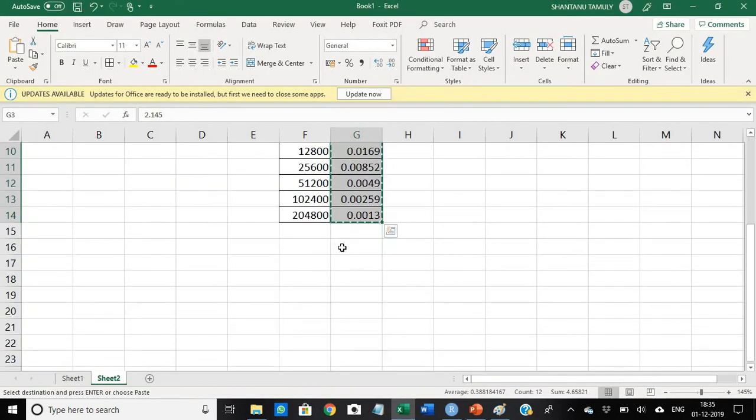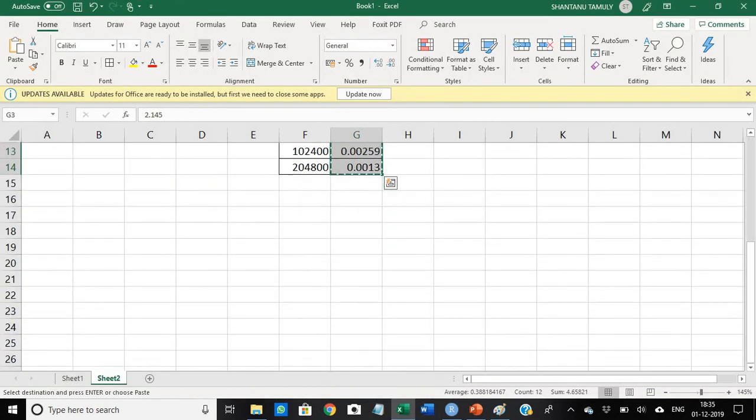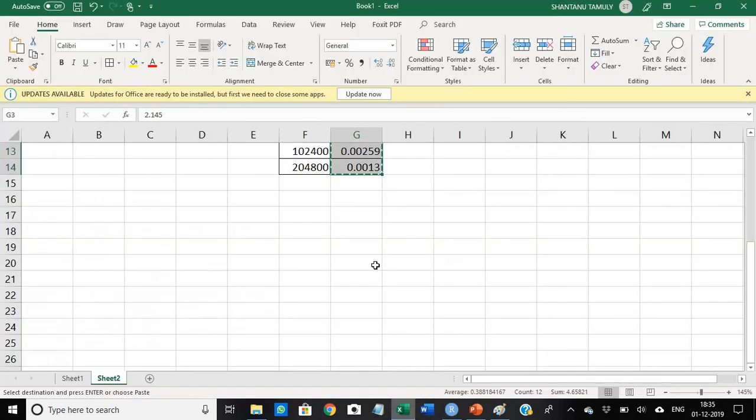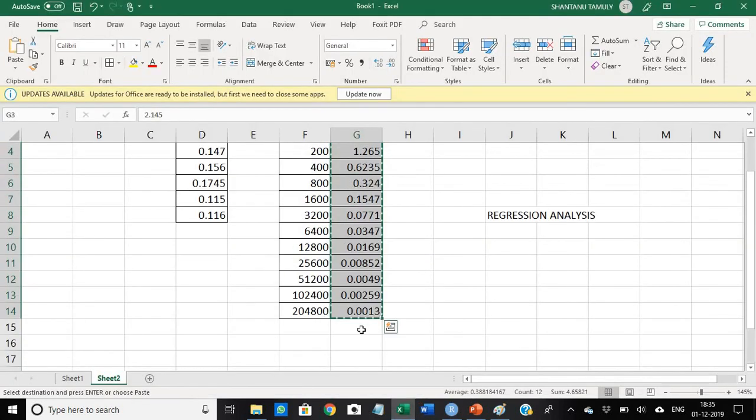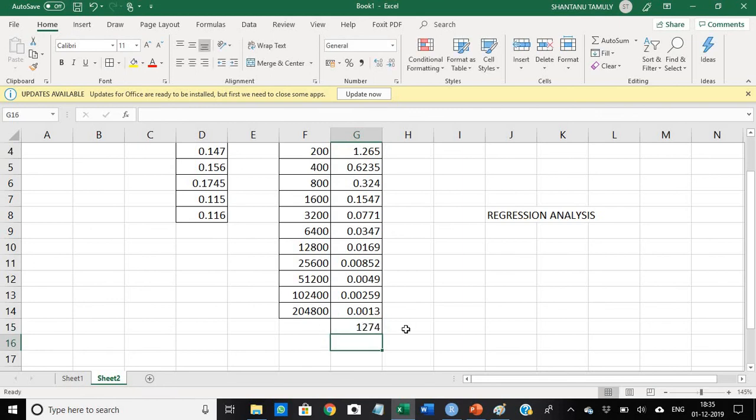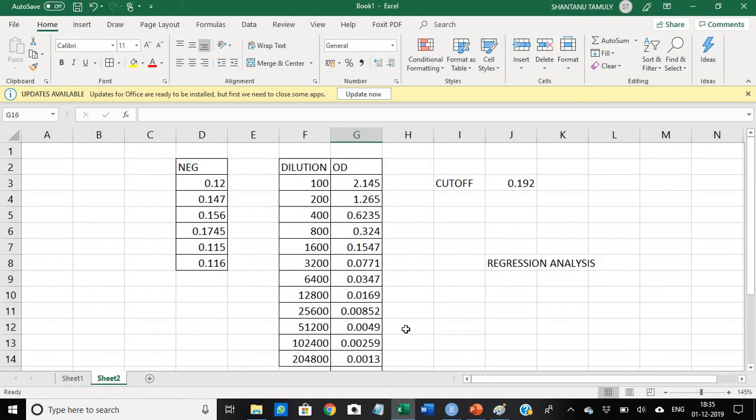So our titer is 1,274. This is our titer value.